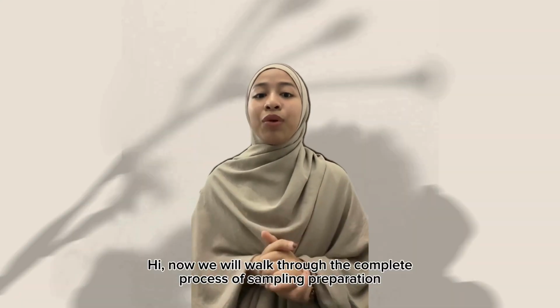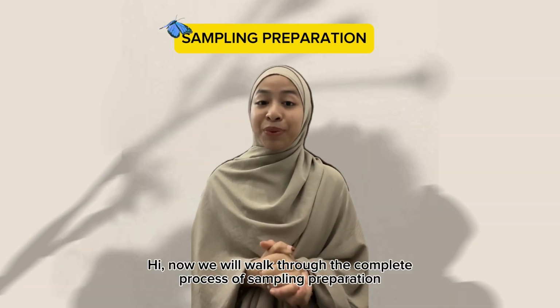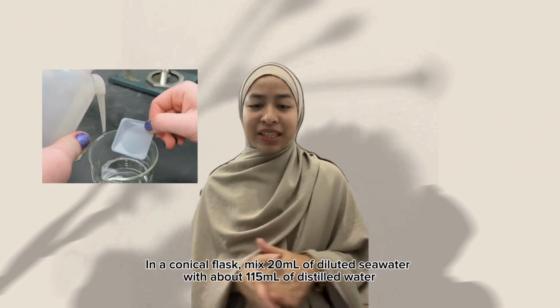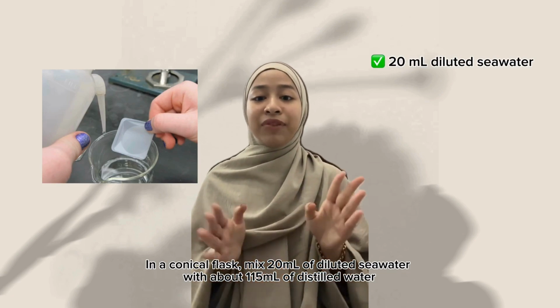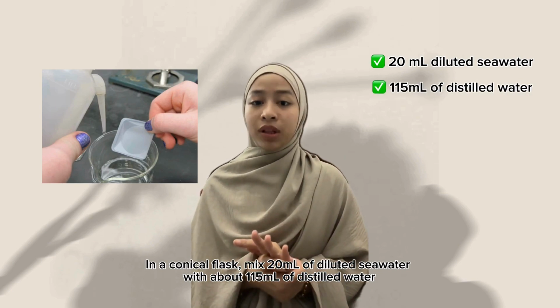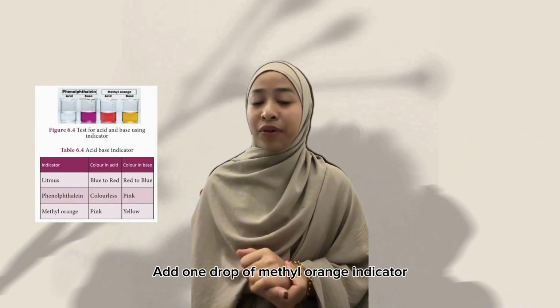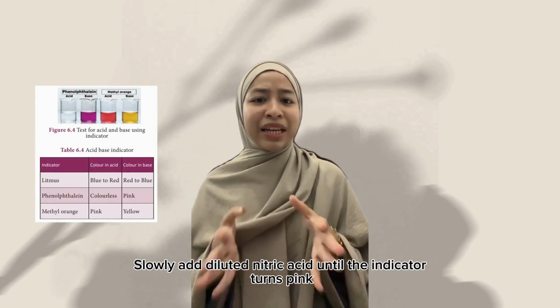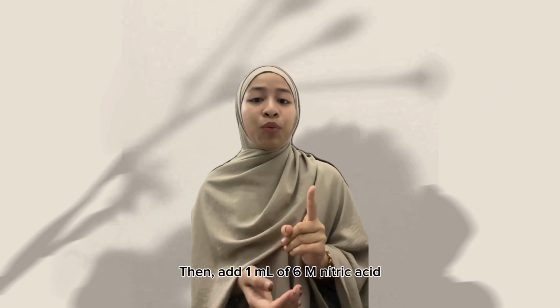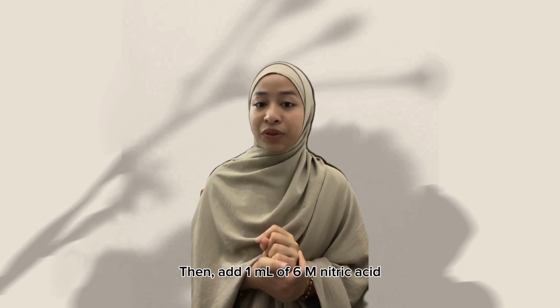Hi, now we will walk through the complete process of sampling preparation. Let's start with the preparation phase. In a conical flask, mix about 20 ml of diluted seawater with 115 ml of distilled water. Add 1 drop of methyl orange indicator. Slowly add dilute nitric acid until the indicator turns pink. Then add 1 ml of 6 molar nitric acid.